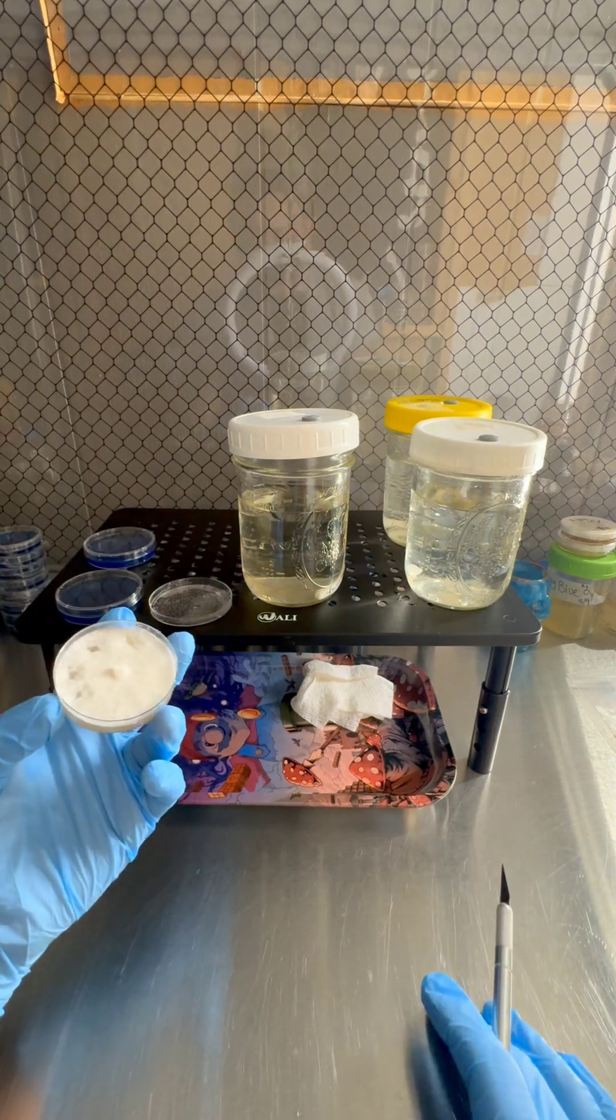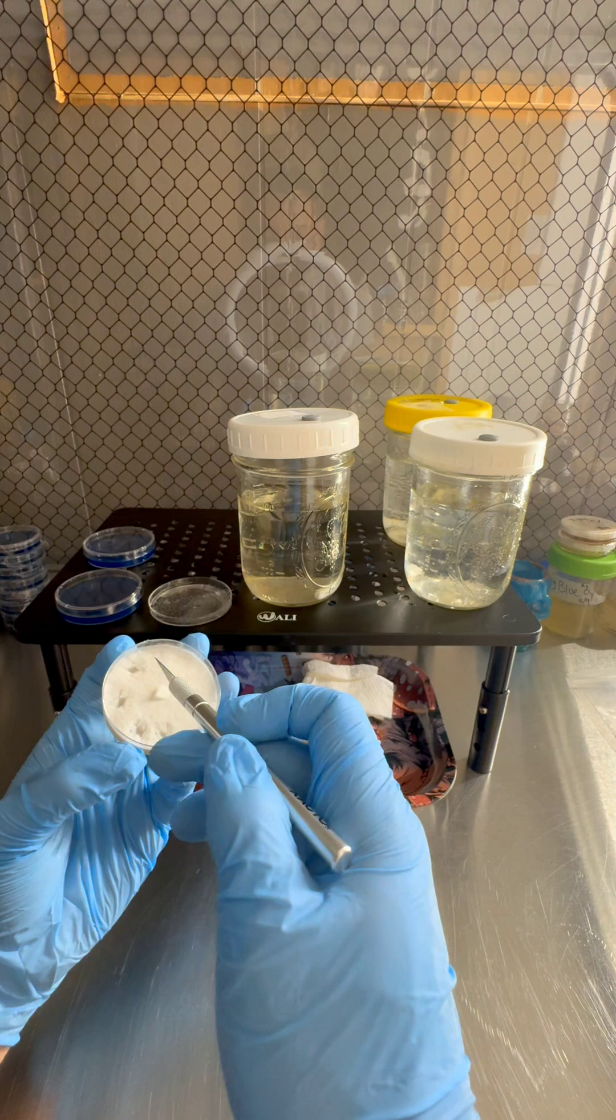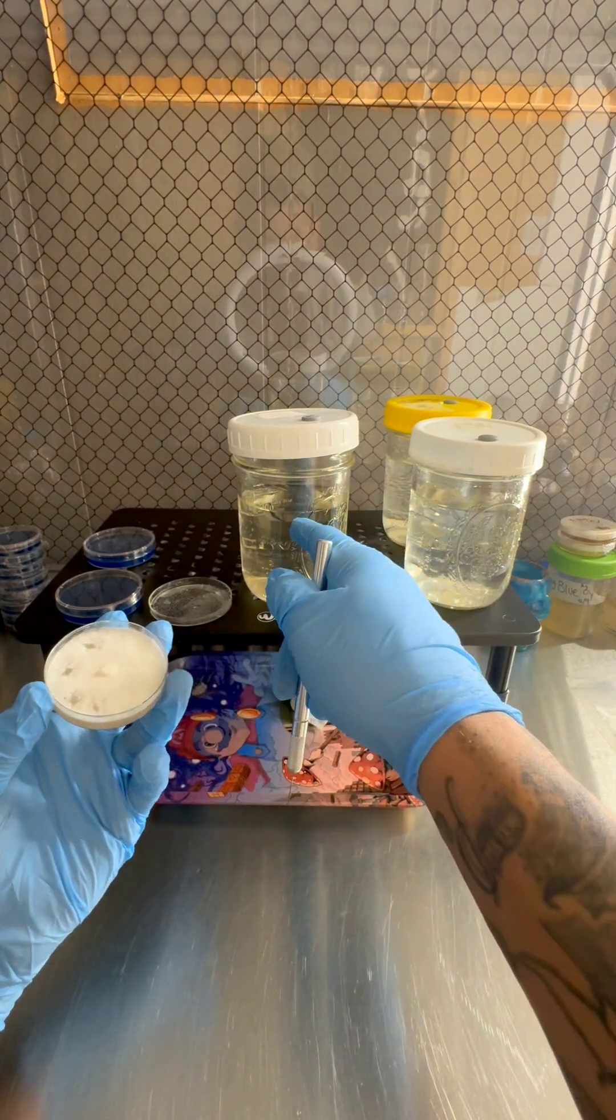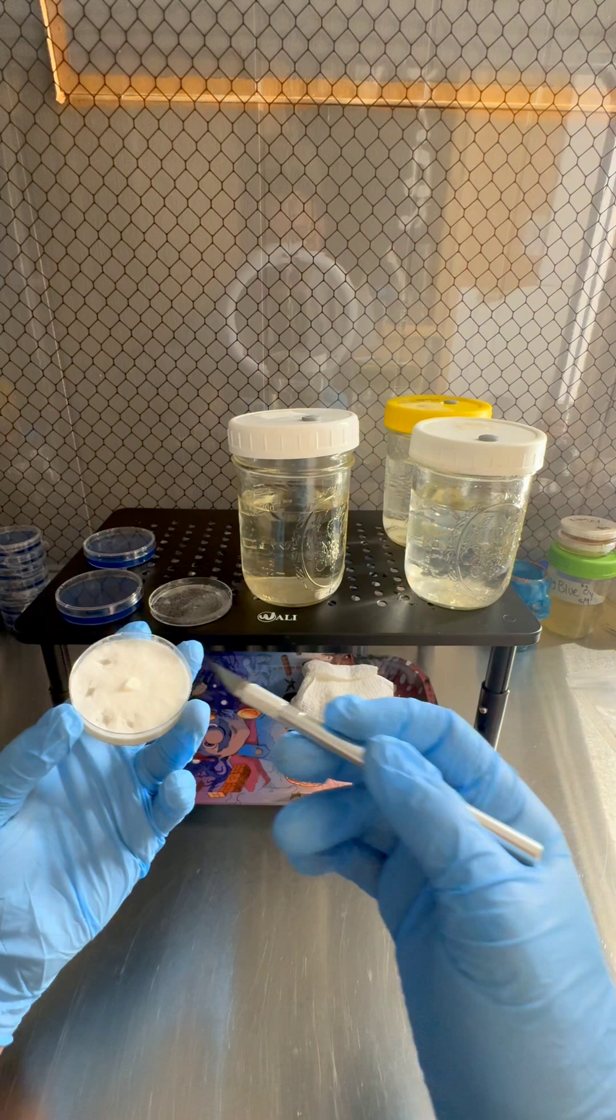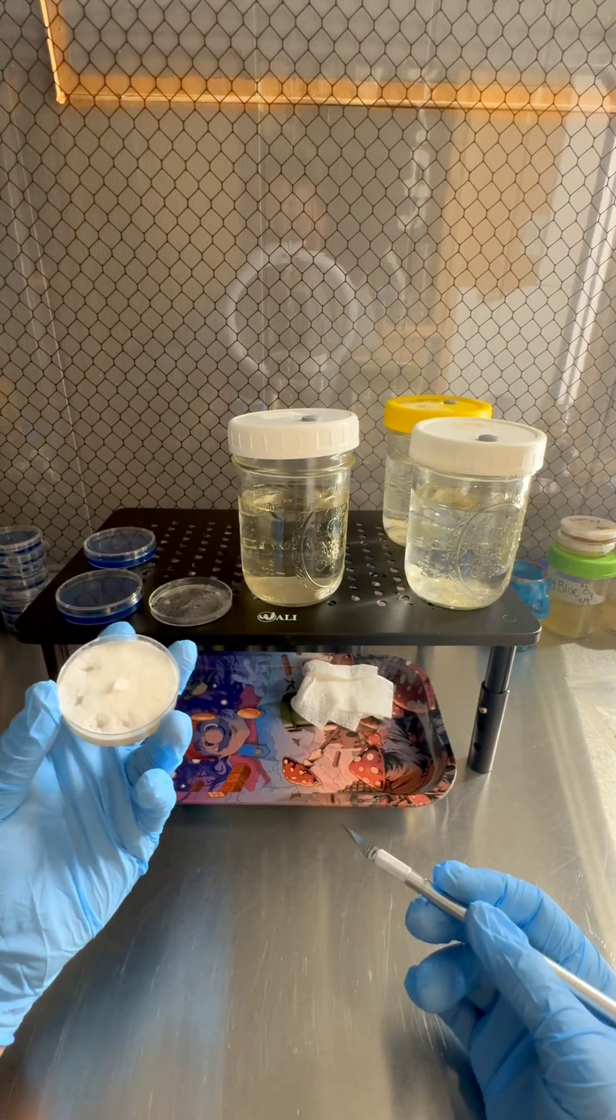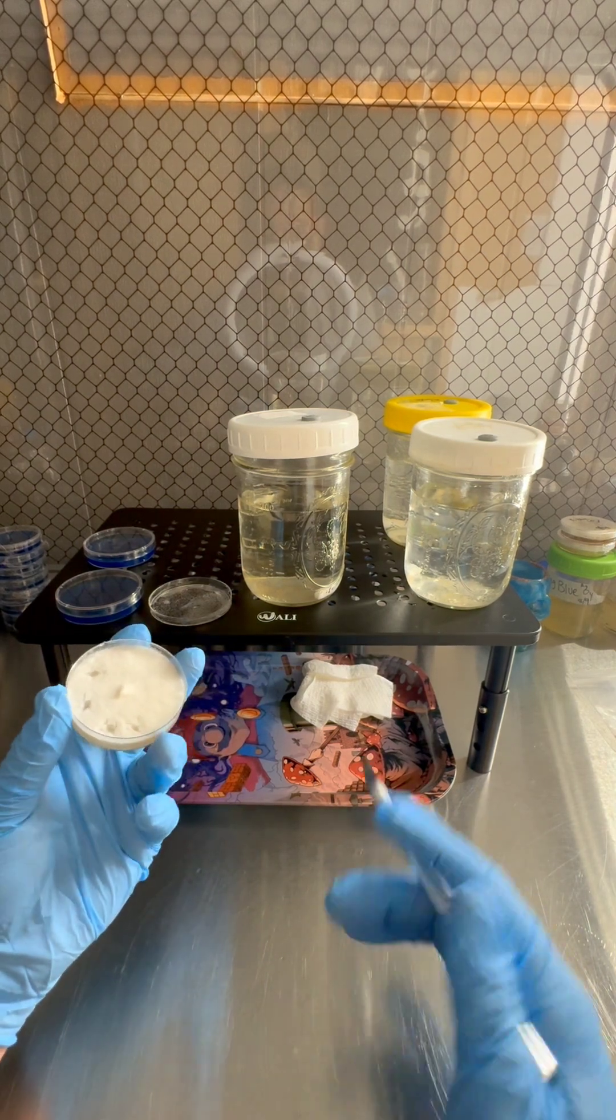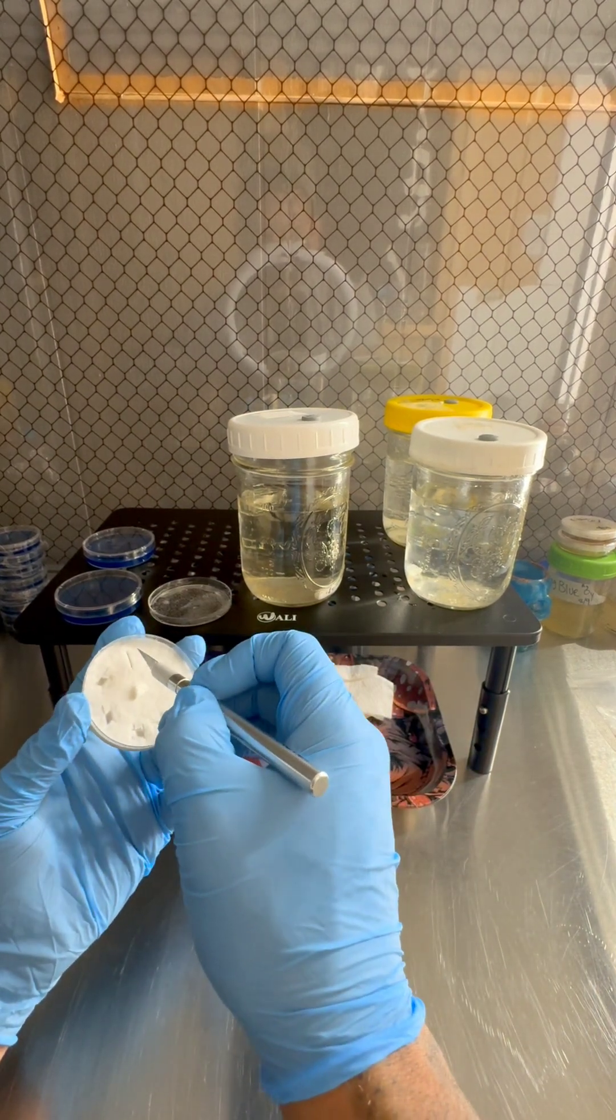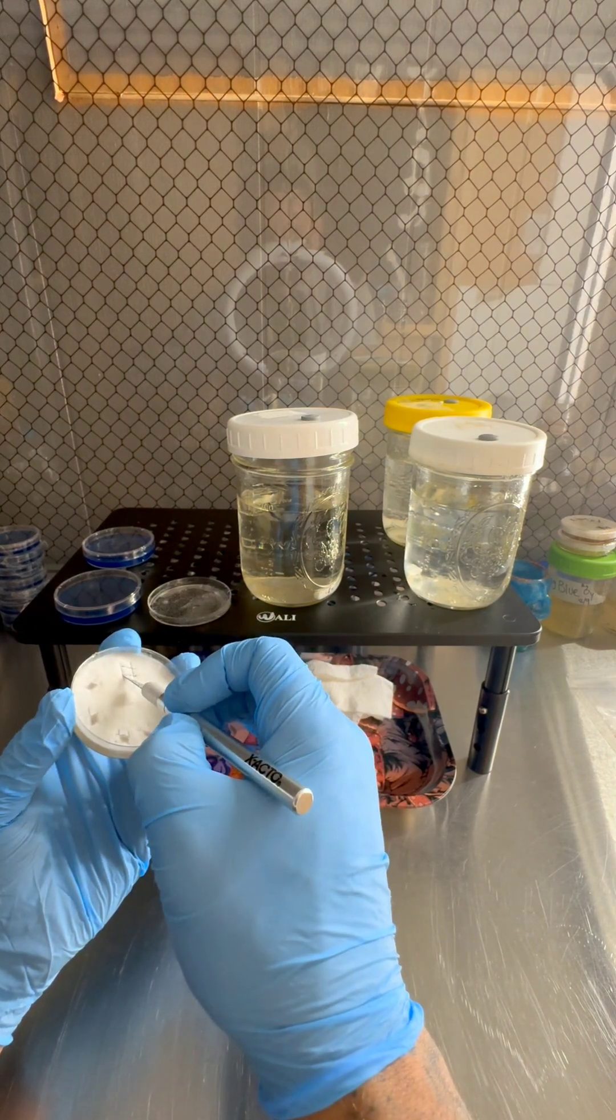So we got some mycelium on some agar right here. All we're gonna do is take a small piece and we're gonna transfer it into this jar. And that's gonna make some liquid culture just from this. So this is another way to inoculate your agar. You want to make sure you do this under a flow hood or in a still air box. Make sure this environment is very sterile. All you need is a little square. You can make it a triangle. Whatever shape you like. I like squares.